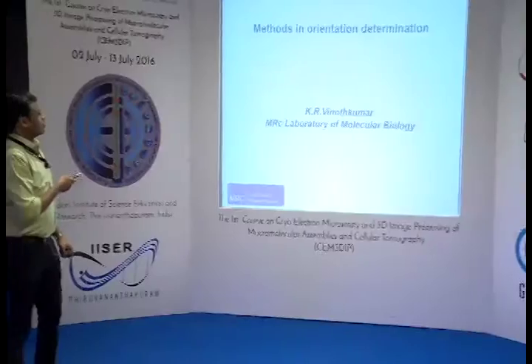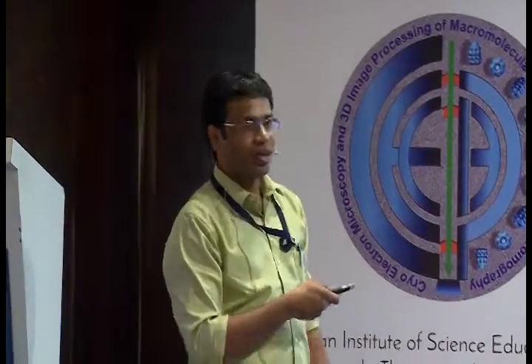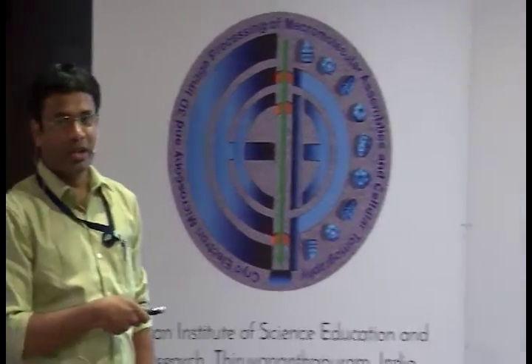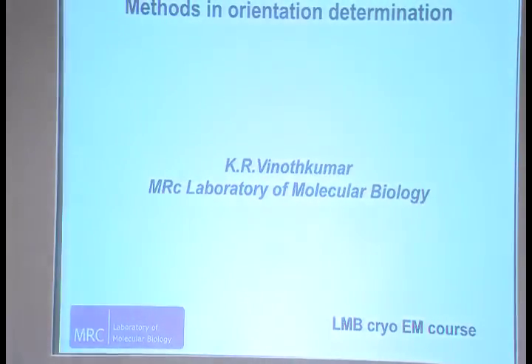Okay. The title says Methods in Orientation Determination. I've nicked a lot of slides from one of the courses which was held in LMB. So in case you find mine boring, you can have a look at the course which is freely available on the net. Also, there are movies of the speaker speaking. So in case you find me boring, you can have a look at this.